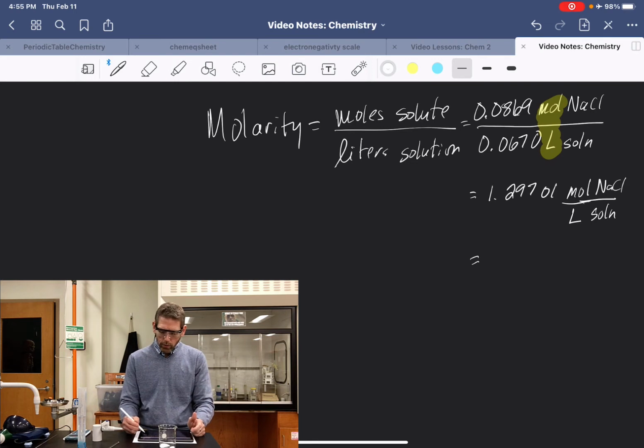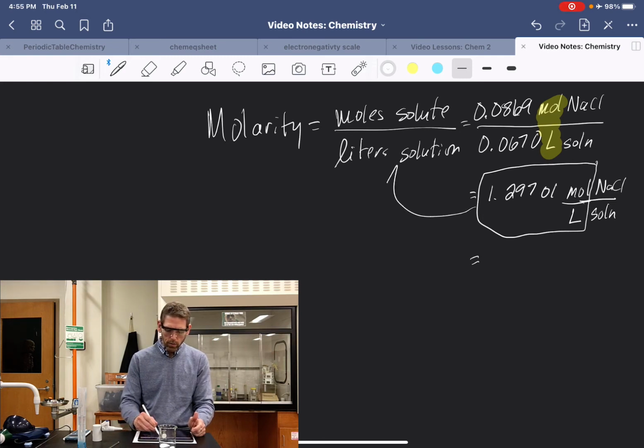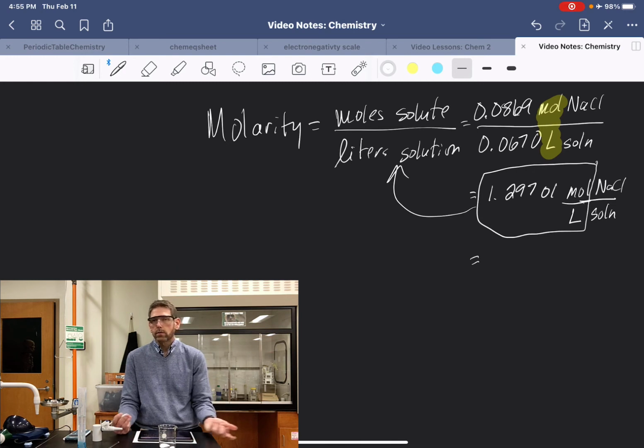And so what we typically do is we just take this part right here, and you can see that matches up to that. The only thing that changes is which solute you are using. Typically we're going to use an ionic salt. Typically we'll be using distilled water. But your solvent doesn't always have to be water. Sometimes it could be an alcohol, it could be an oil. It just depends on the properties of the substance you're trying to have in solution. Okay?